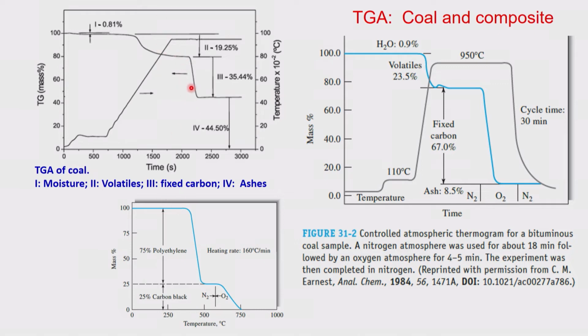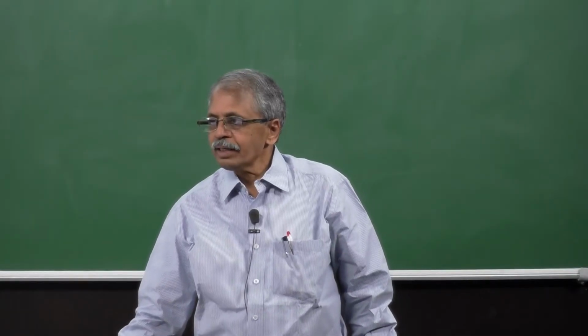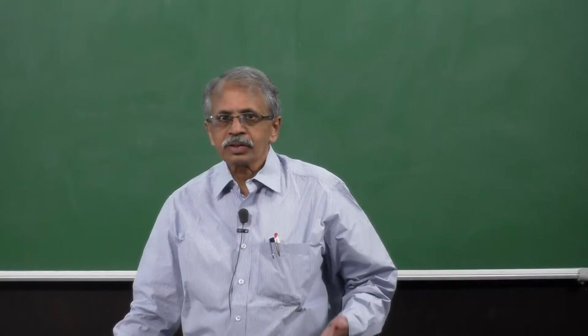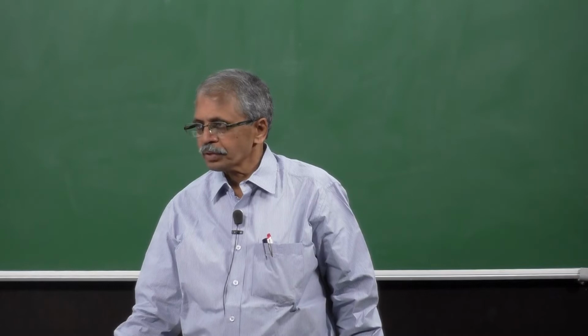Whatever carbon is present in that gets burned, depending upon what atmosphere you are doing, and this must probably be used in air. So then this will get burned, and then you have the ash. Whatever ash is left over, we will come to that too. So, you have the percent of volatile organic ones, carbon itself, and the ash, which is basically inorganic based ones, oxides, hydroxides, those kinds of things of metal based ones.